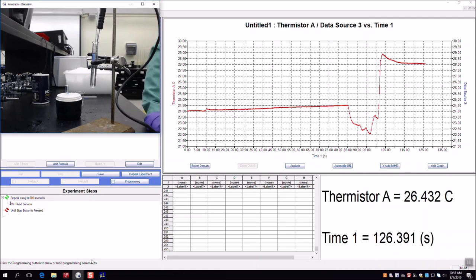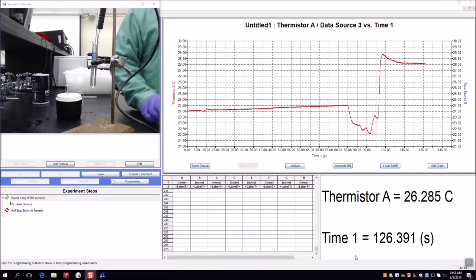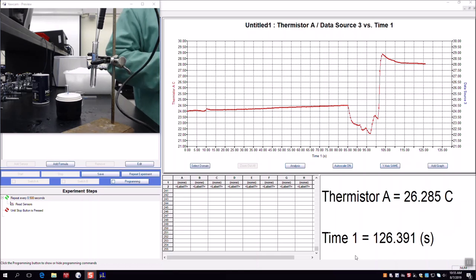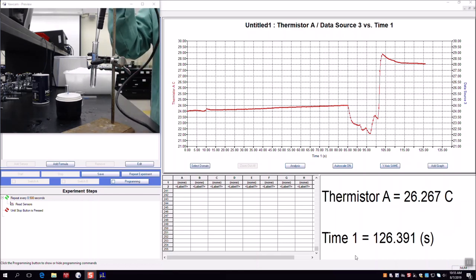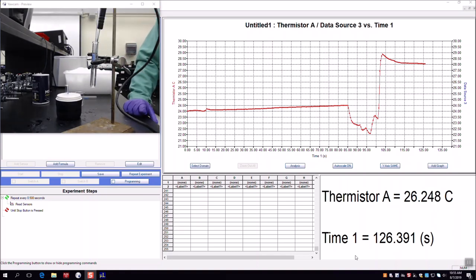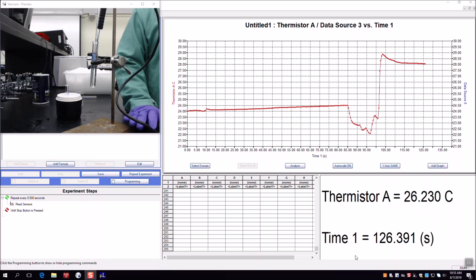Now I'll go over to Excel to show how to analyze the data from the heat of solution portion. I do want to reiterate that the data shown in this portion — my two numbers — will not necessarily match the data in the third part of the video, because we re-performed this part using a better mixing method. If the data doesn't line up perfectly, don't worry — it's still good data.